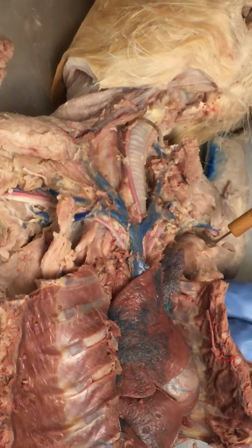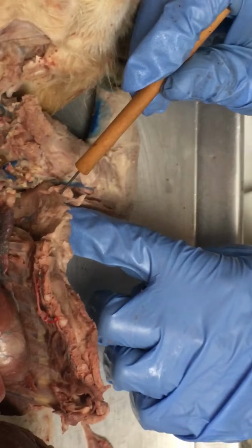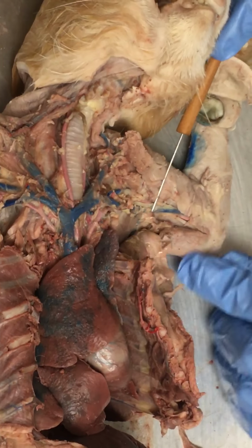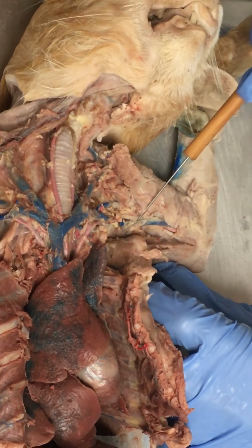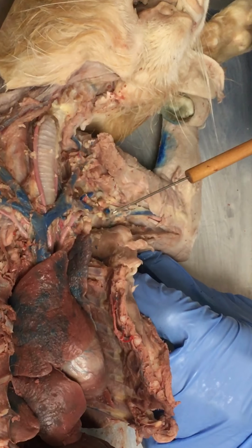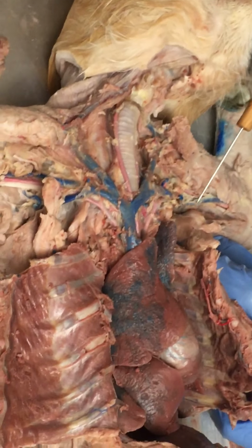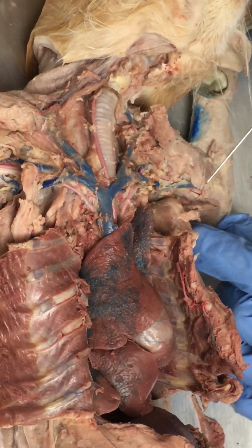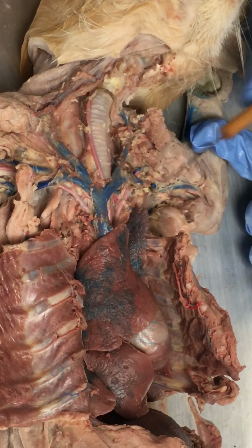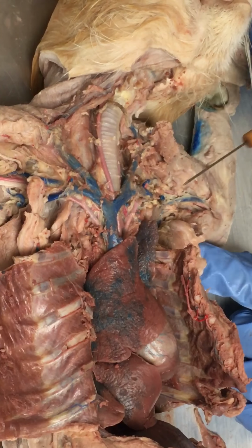So right here, we've tried to put everything back in its anatomical position. This would be the axillary region, armpit, right? So if we take that line and extend it up here, then where that blood vessel crosses our axillary region, now we're just going to call it the axillary vein. It's the same blood vessel. I've snipped it here, you can see, but Kelly snipped it. No, it was me. So we call that the axillary vein. And then down here, once we're clearly out and onto the arm, we'll call it the brachial vein. So subclavian, axillary, and brachial, just based on location. So that one vein has 3 names.